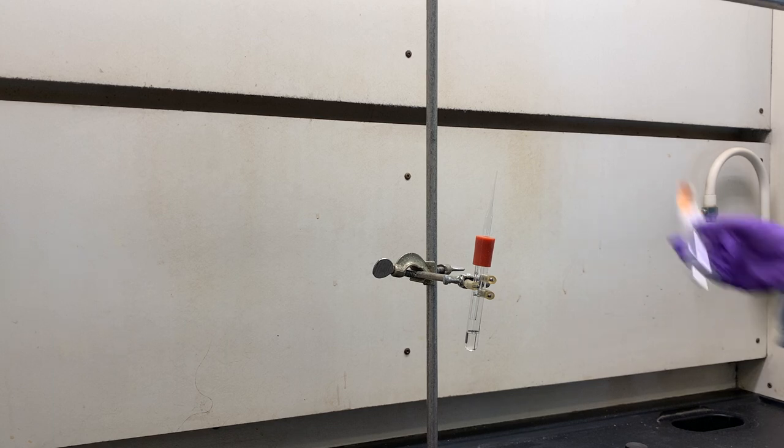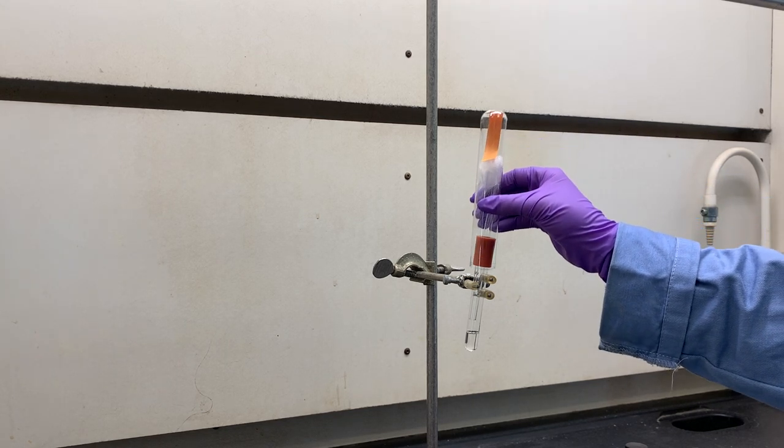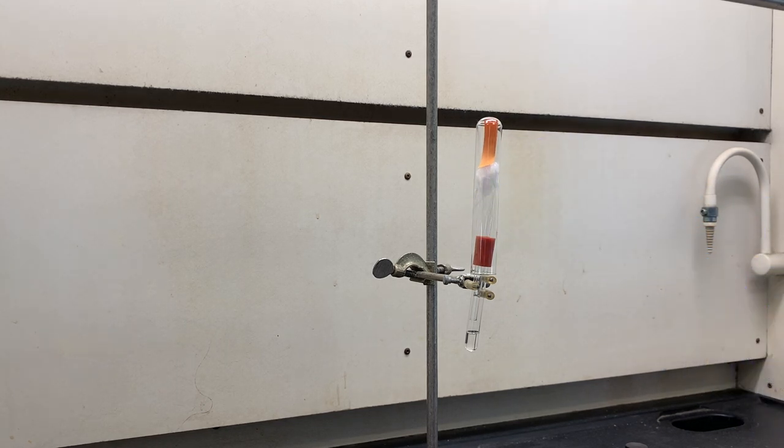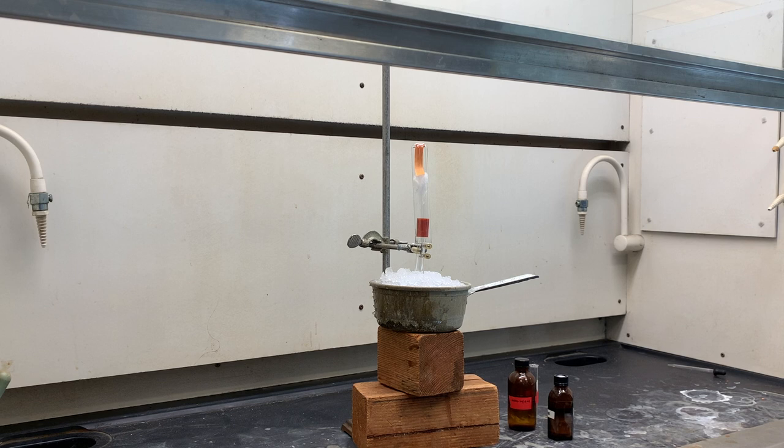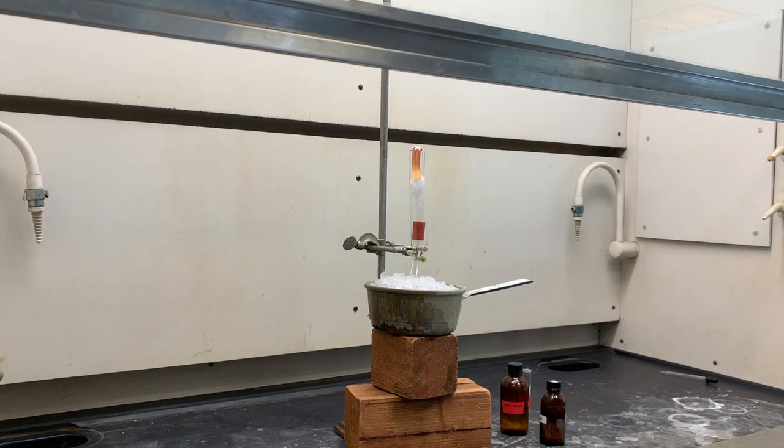Obtain a large test tube and place a piece of litmus paper inside, followed by a wad of cotton. The moist cotton will trap the HCl gas produced in the reaction as indicated by the litmus paper. Cool the reaction in an ice bath.